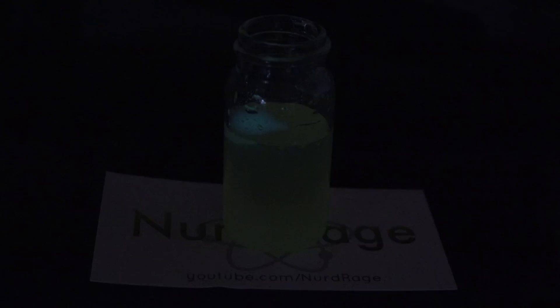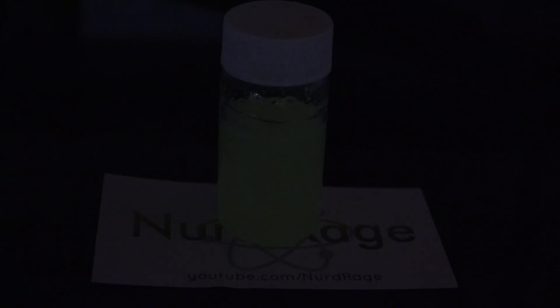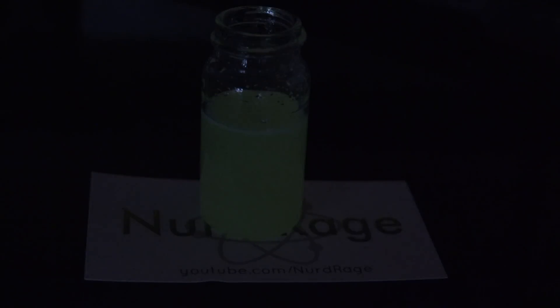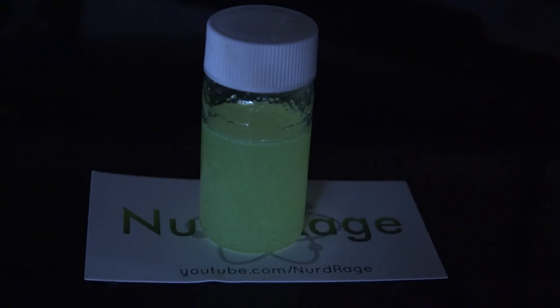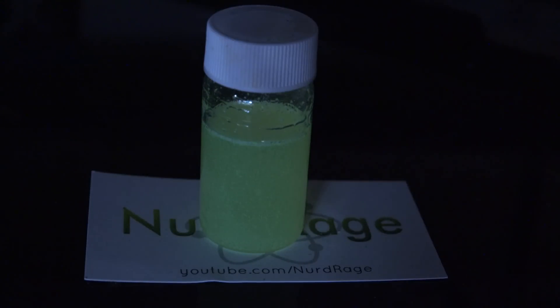Looks like something is happening — the sodium acetate powder is glowing, possibly indicating a reaction. Let me shake it up to distribute it. Yeah, not really working. Let me add in some more of the methyl ethyl ketone peroxide — about 10 drops or so. It might be working a bit but it's rather dim. I'm going to let it sit to see if it needs more time. At this point I'd call this a failure. Although it does seem to be glowing a bit, it does not possess superior qualities to straight hydrogen peroxide as an activator. The cost of this methyl ethyl ketone peroxide doesn't seem to justify it; I'd be better off spending my money on hydrogen peroxide.